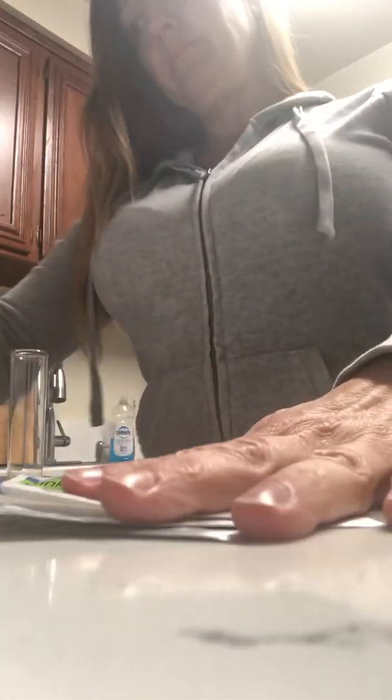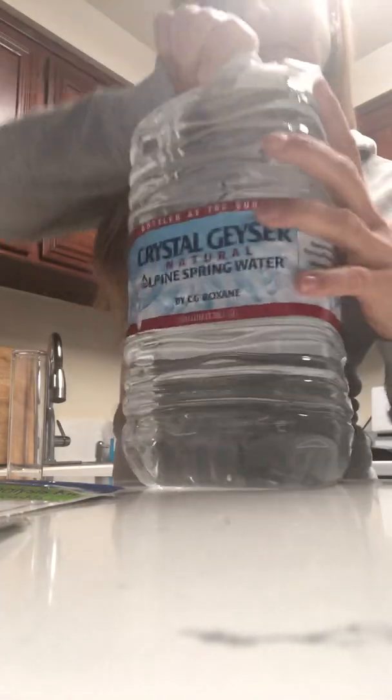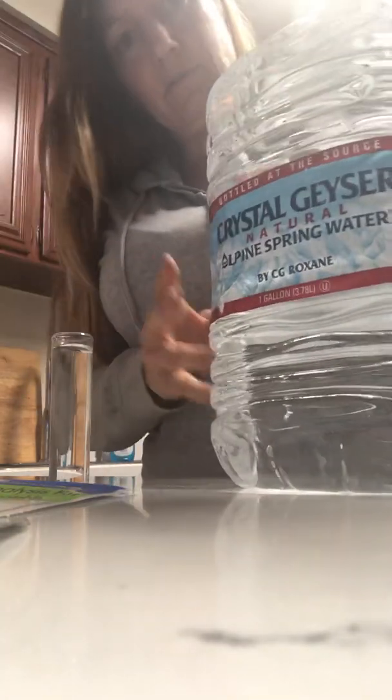We're supposed to pour some water in here, so let me get that going for you. Okay, so here's Crystal Geyser. I can't wait to test this one. I drink this one all the time and I feel great, so I'm hoping it's going to be a winner. Crystal Geyser — that's the one we're testing.